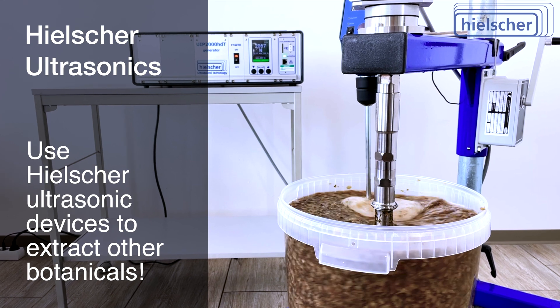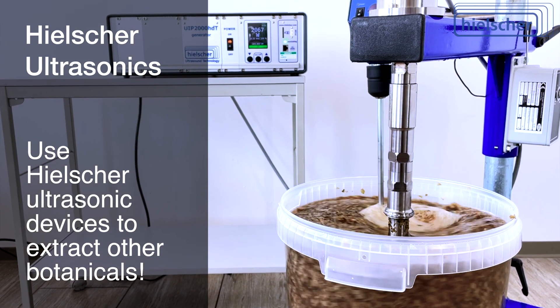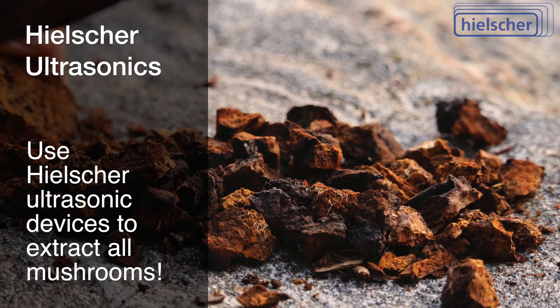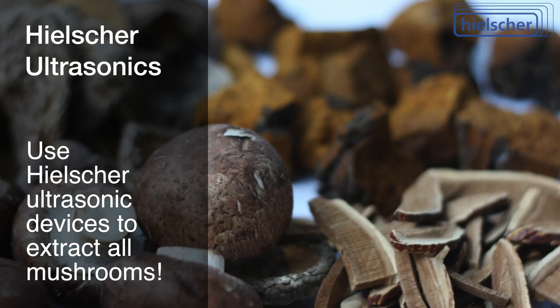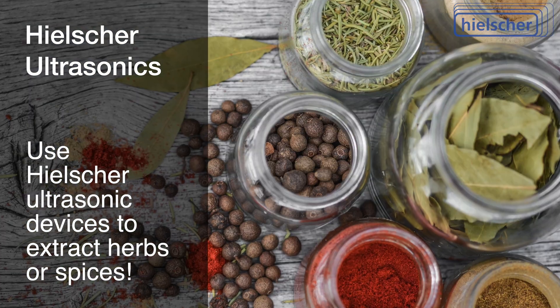With ultrasonic extraction, you can extract bioactive compounds from any other plant material. You can use Hielscher ultrasonicators to extract all kinds of mushrooms, cannabis, medicinal plants, coffee or tea, herbs or spices.